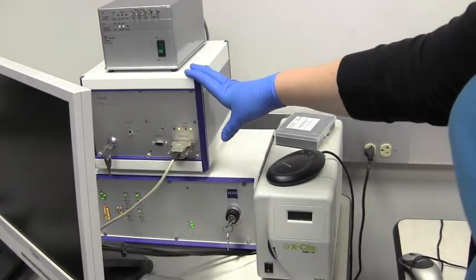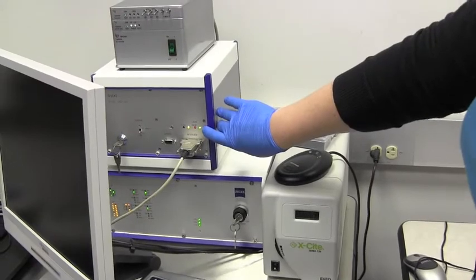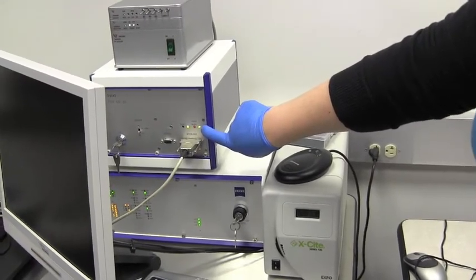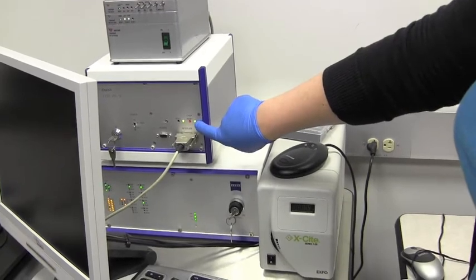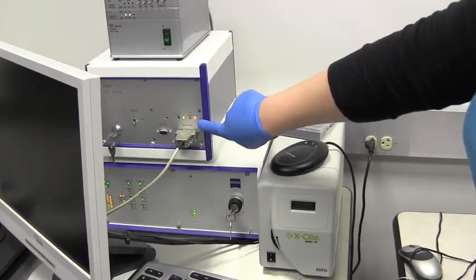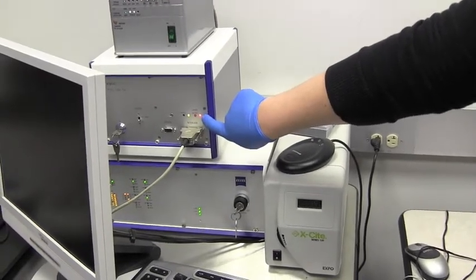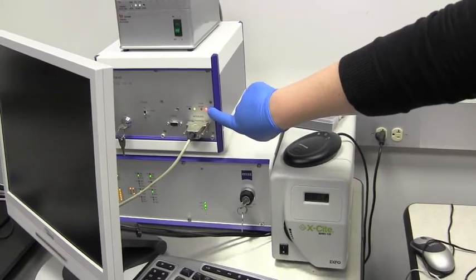Now when you first turn on the laser power, you're going to have a green light to the right of the laser on off red button. After this has been lit for a few minutes, you can then hold that down and it will turn red. The red means the laser is powered on and ready to go.